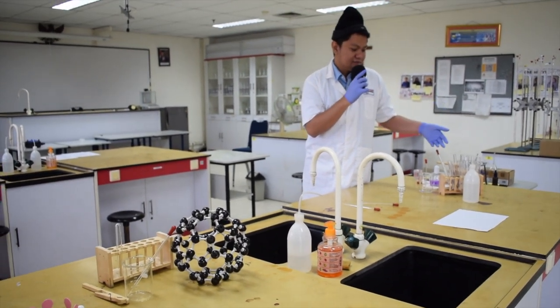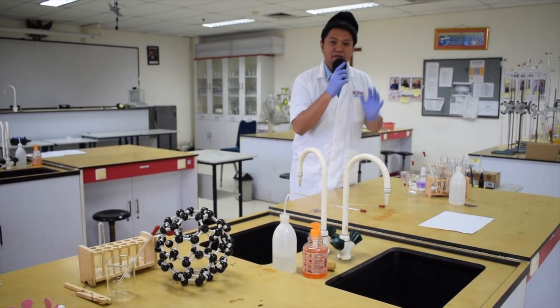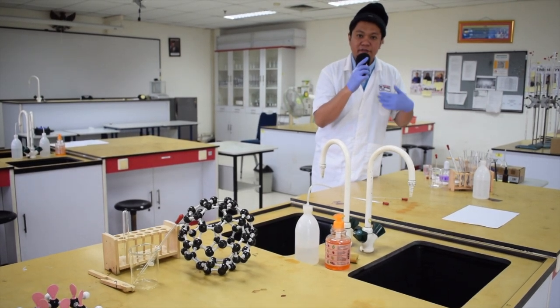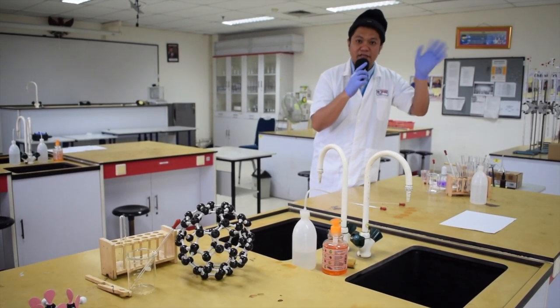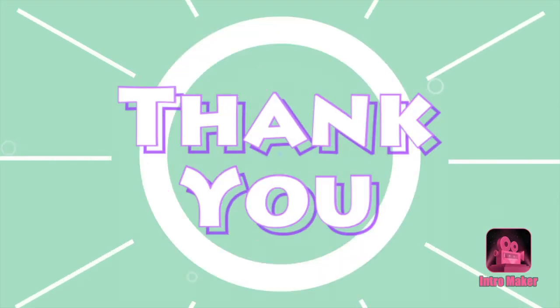Today we have already detected the three ions: Zn²⁺ (zinc 2 plus), NO₃⁻ (nitrate), and NH₄⁺ (ammonium). If you still have any questions, put them in the comments below or ask Miss Mia. Cheerio, goodbye — I'm going to clean this up!